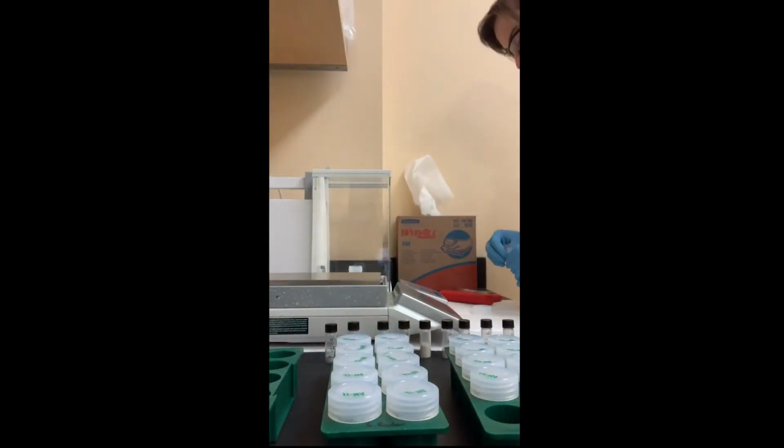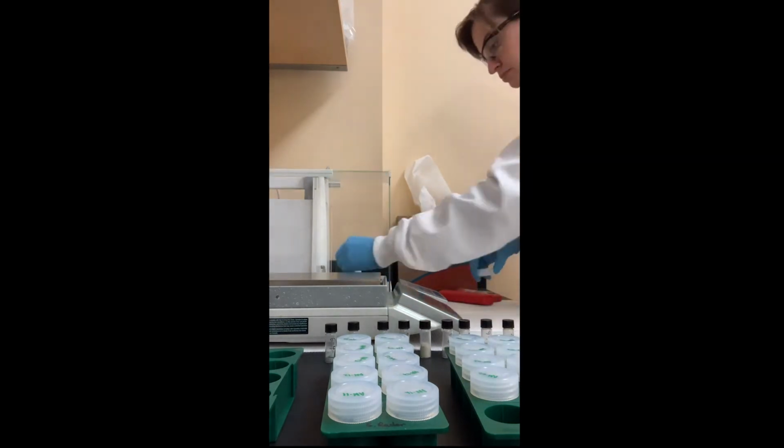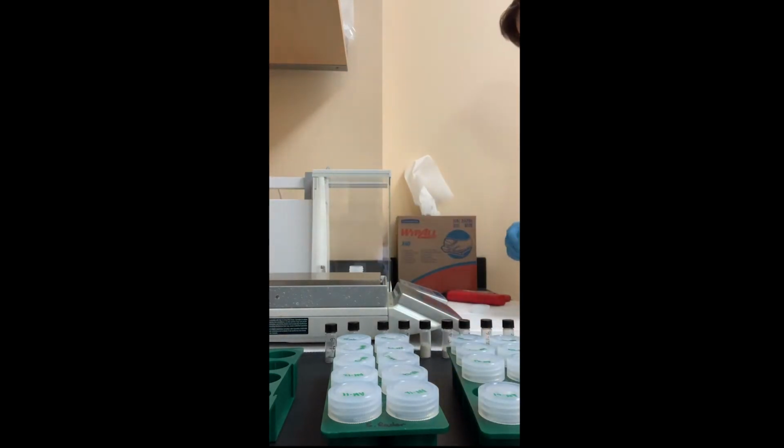Once we have our sample crushed, then it's time to weigh it out. Here we have to be really precise and really careful because this is how we ultimately determine what the concentrations in our metals are. It all depends on how much we weigh out. So you can see this is kind of a labor-intensive process, and again, you have to be fairly careful and avoid contamination, but it ends up resulting in some really neat work.